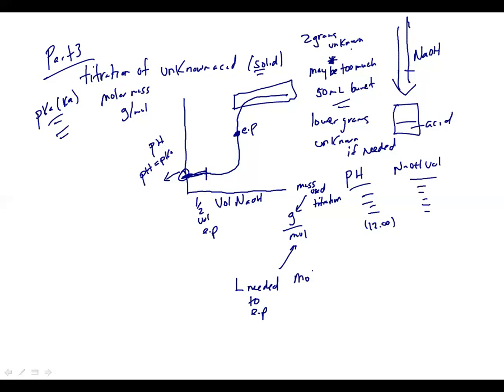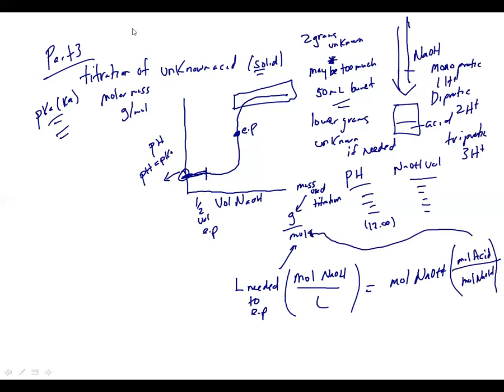That will give you the moles of your sodium hydroxide. And I believe you may have either a monoprotic, diprotic, or triprotic acid. So I think somewhere will tell you if it's monoprotic, diprotic, or triprotic. I just don't recall, I'm sorry, off the top of my head. I almost want to say they're all maybe monoprotic, but I could be wrong.